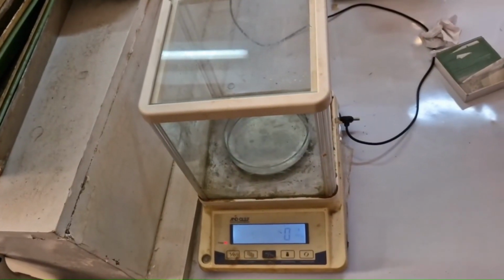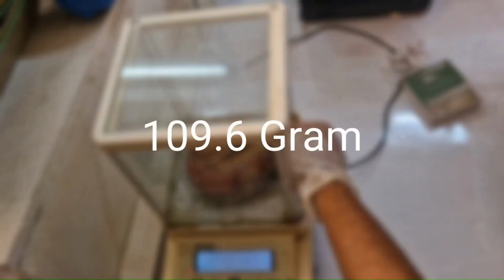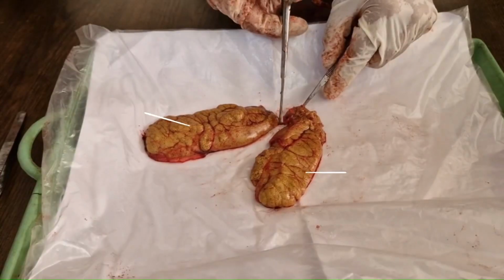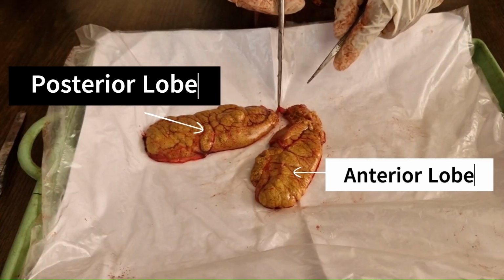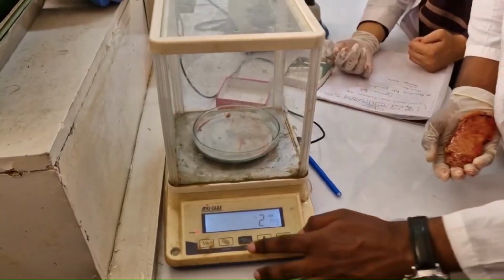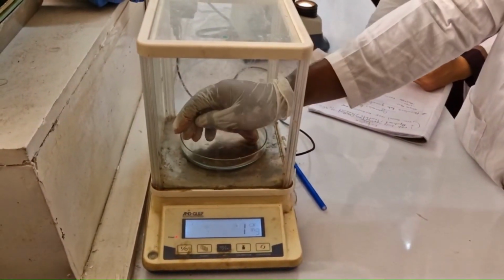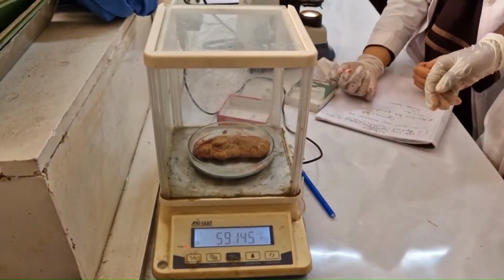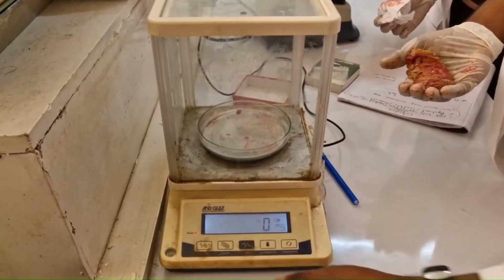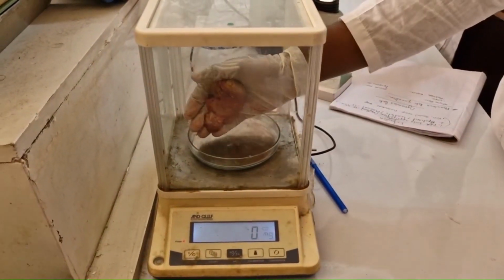Then we weighed the gonad and found the result 109.6 grams, and separated the anterior and posterior lobes. Firstly, we weighed both lobes. Anterior lobe 59.52 grams. And the posterior lobe is 49.01 grams.